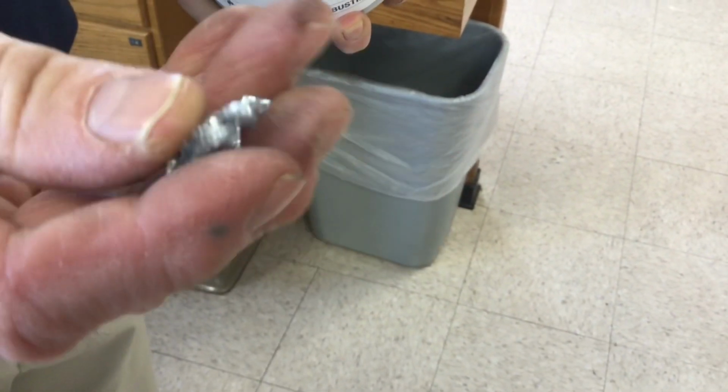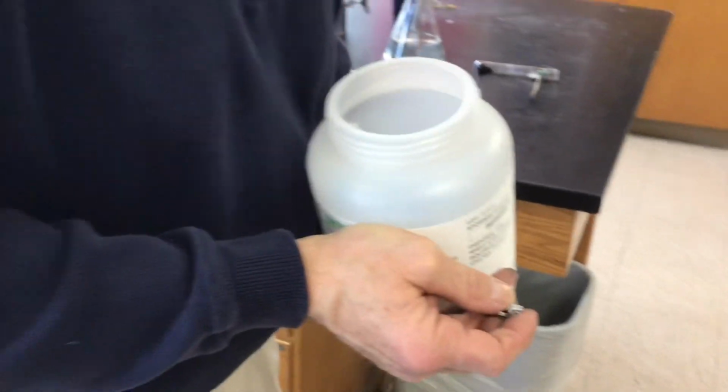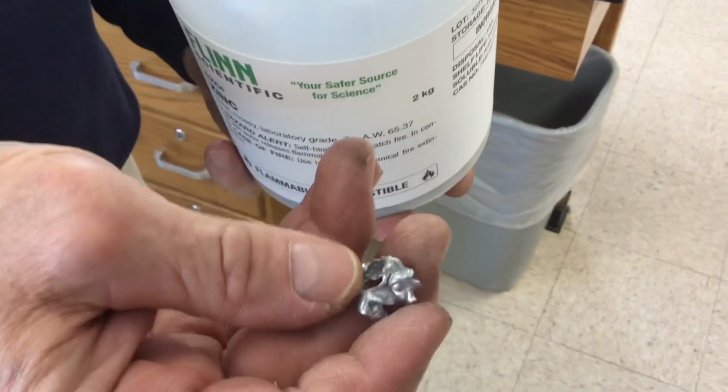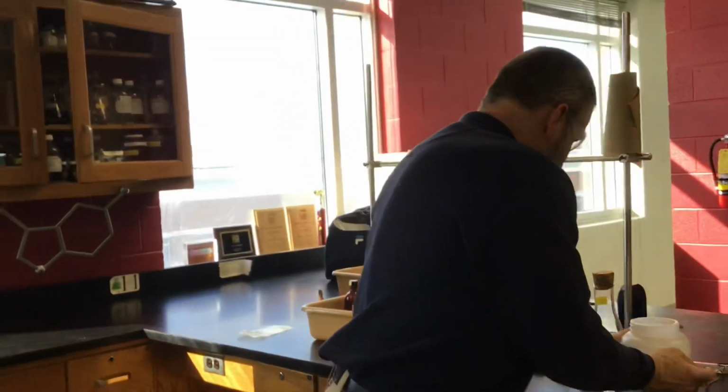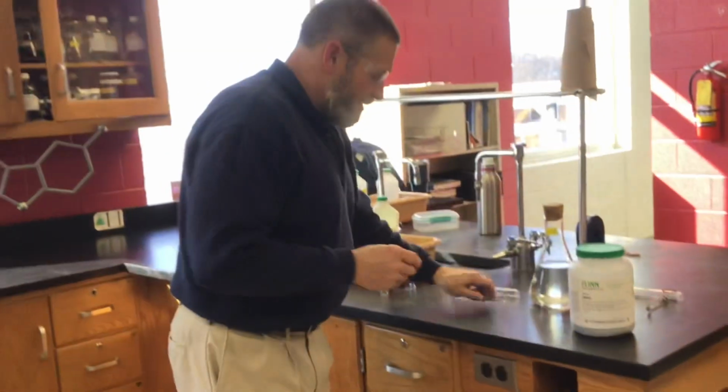You'd expect it to be nice and silver. That's very nice zinc, too, because we had an old bottle of mossy zinc for a long time. It was a dull gray. And then this is pretty and shiny silvery. It gradually oxidizes. It rusts, basically. It reacts with the oxygen in the air. Okay, so I've got my piece of zinc.